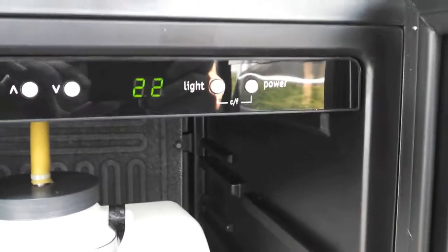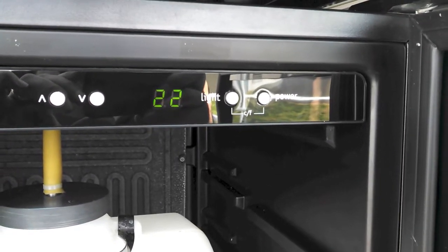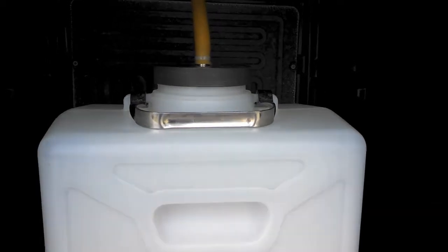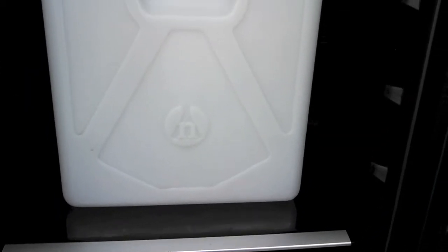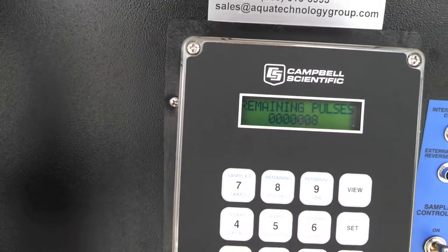This refrigerator is also set up with a digital display. This particular unit just got started up, so we're going to work our way down to where we need it to be. It's set up with a composite type bottle — stainless steel front with a see-through glass door. We're going to go back over and look at the remaining pulses.